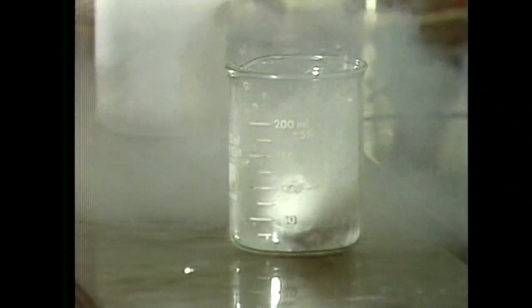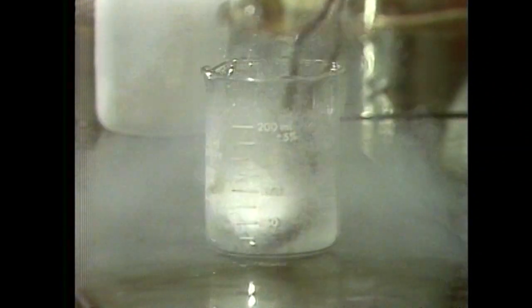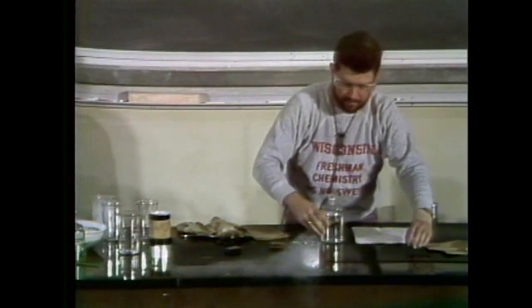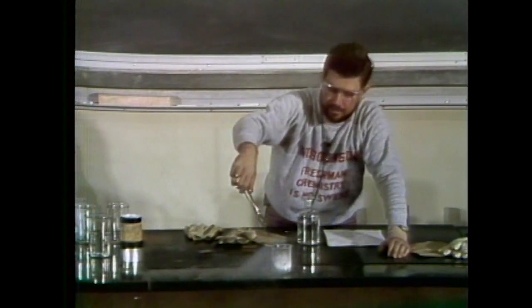Whoops, I keep forgetting that stuff is cold. Let this cook like that for a while. You think it's ready now?